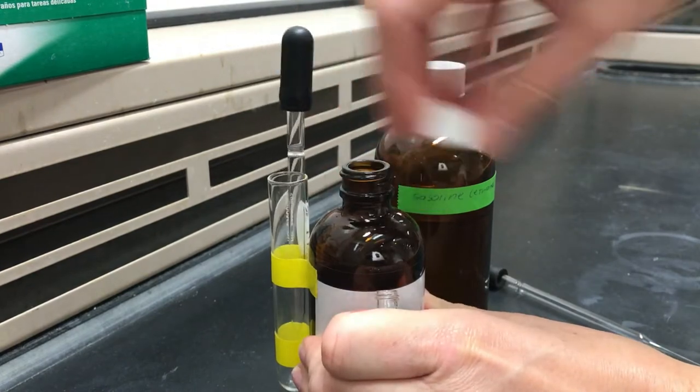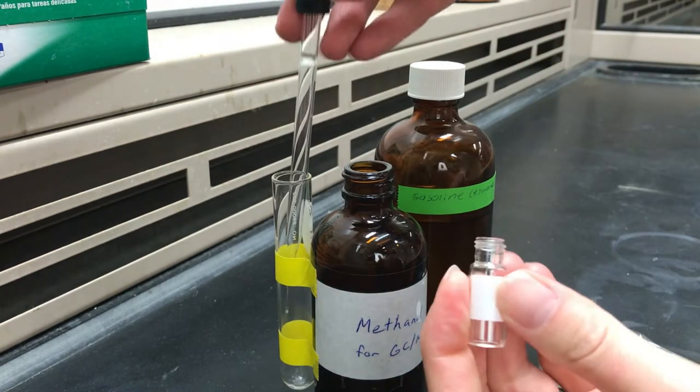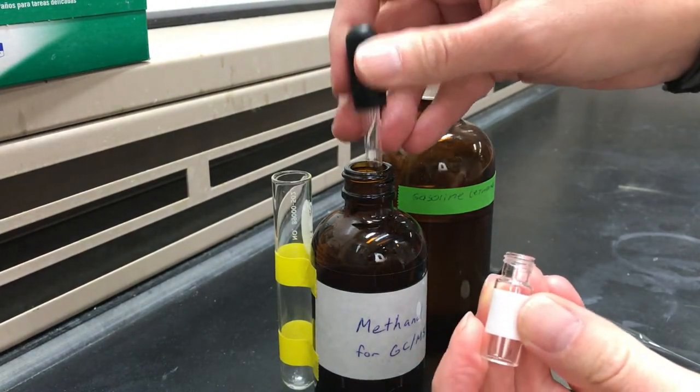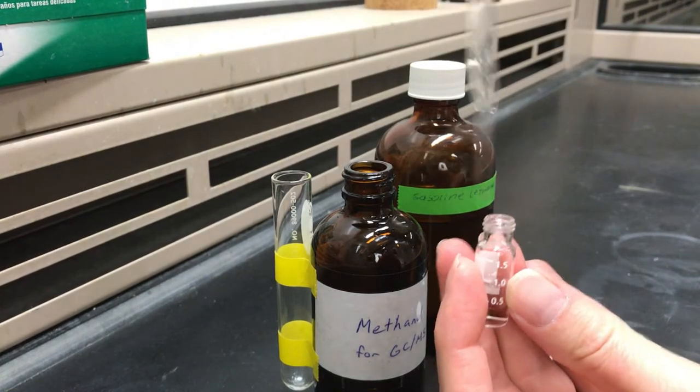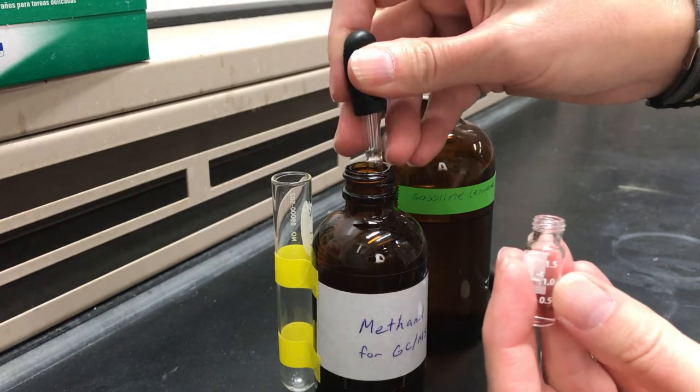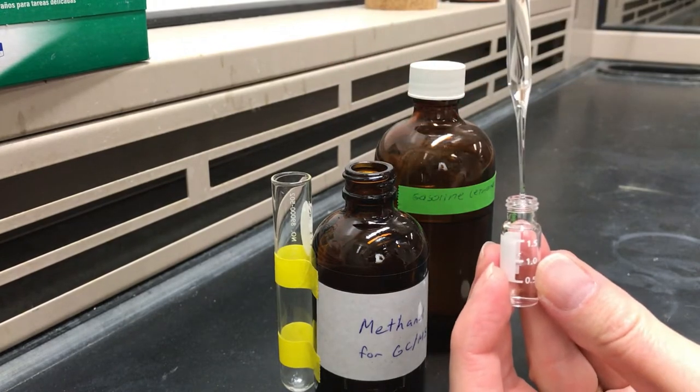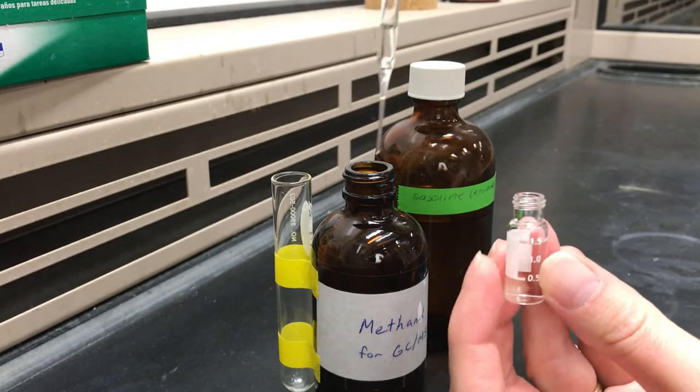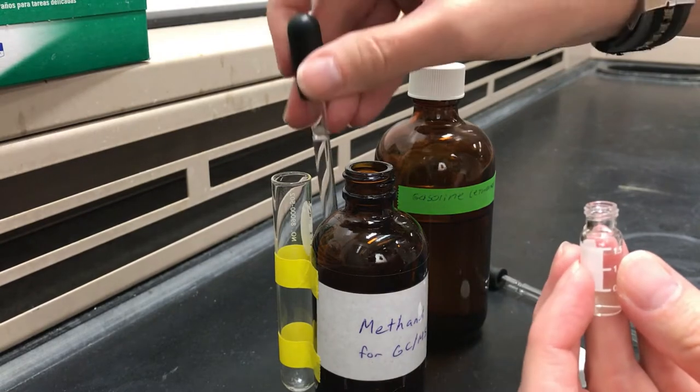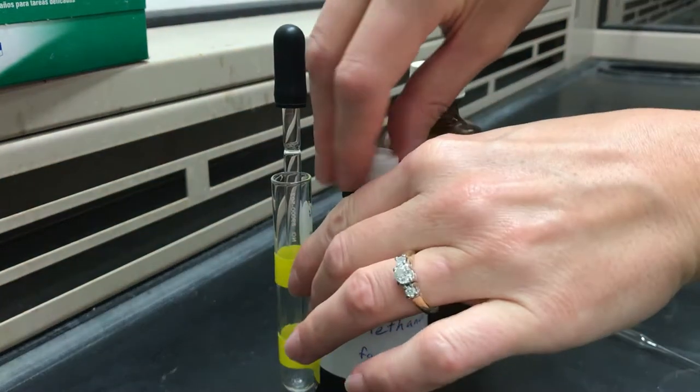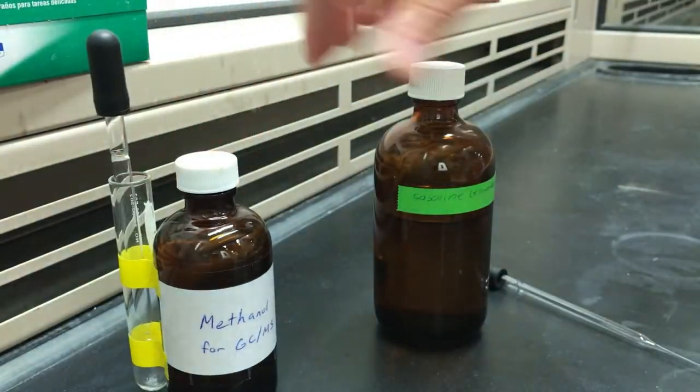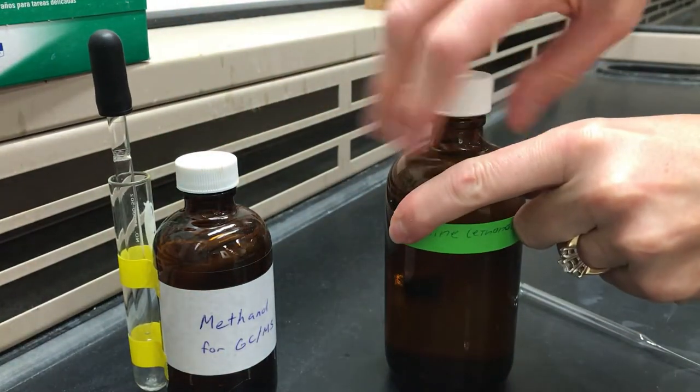So let's start with how to prepare a sample. You want to take a very small GC vial and fill it with a solvent. At my college we tend to use methanol but you can use a lot of low boiling solvents like acetone. You fill it to the 1.5 milliliter mark on the GC vial and then you normally add one drop of the sample that you want to analyze.